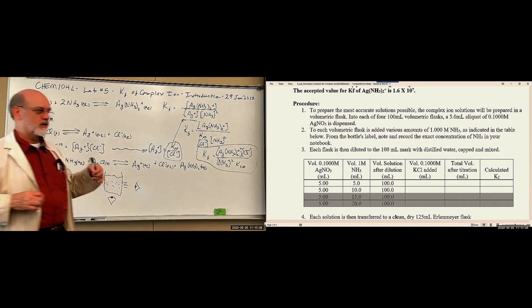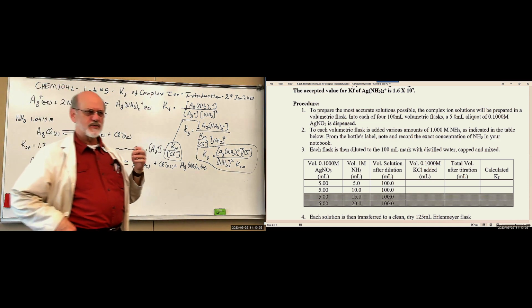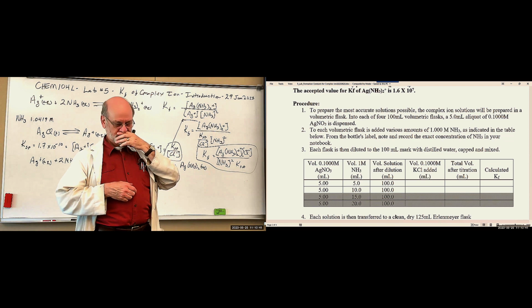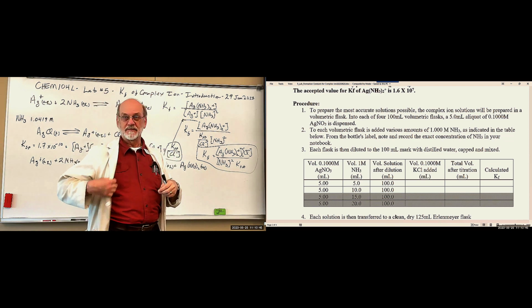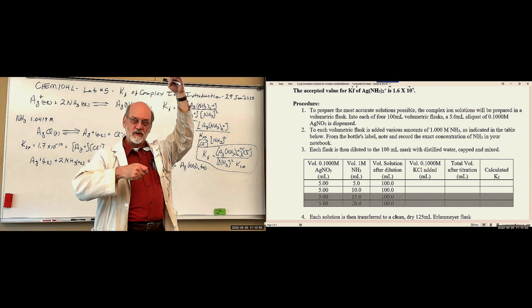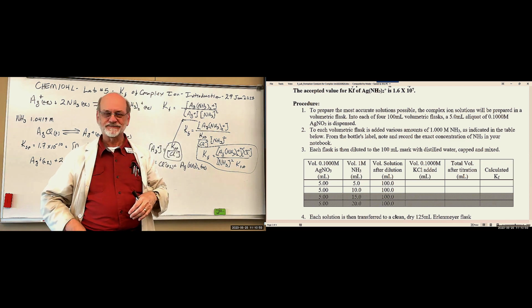One of the reasons you want to start at 0 is because the first one is just you read the burette, and that's your value. But the other reason is those burettes are funny. They're really finicky about the head pressure. The taller column makes drop formation more reliable. If you have more pressure, a higher column of titrant, then it's easier to control. Once you get down to the lower volumes, it's more difficult.